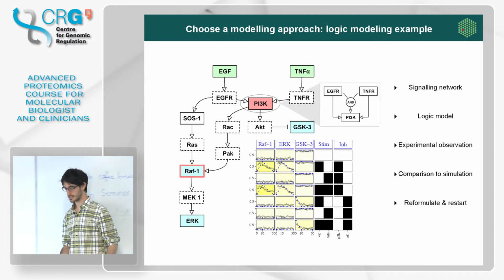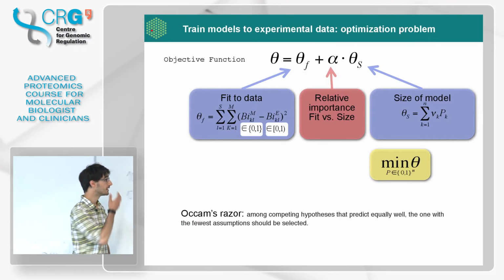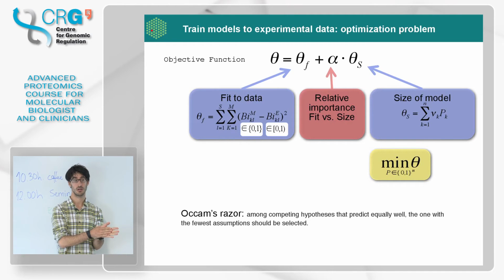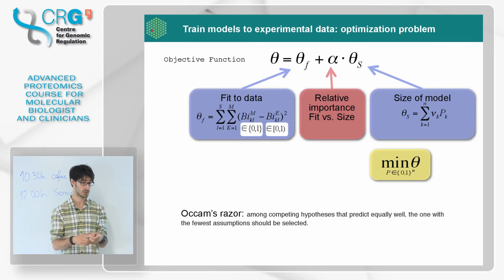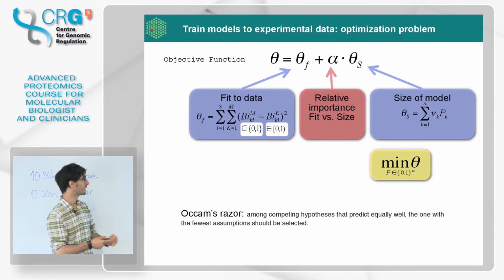Now, I just said this very manually, but actually it's an optimization problem. The value that I was trying to optimize, the background in the color, so the difference between the data that we can see and the data that we can simulate from the model, this distance is what we're trying to reduce. We're trying to minimize it.